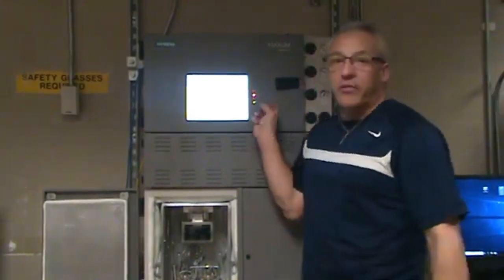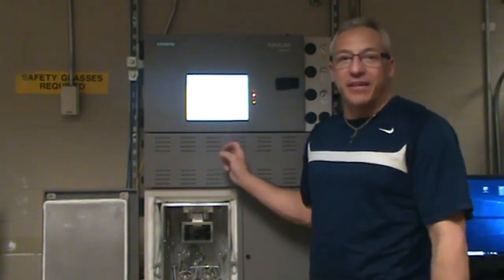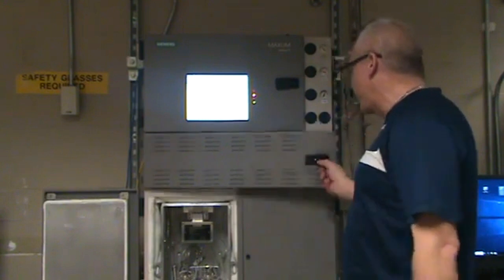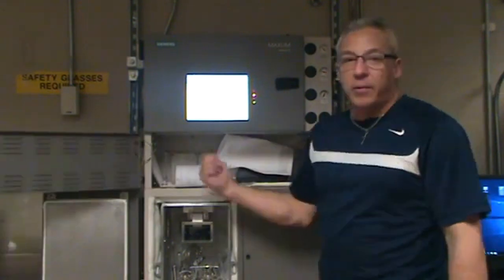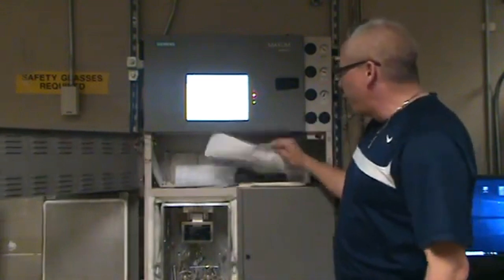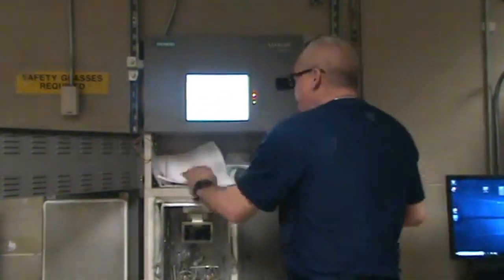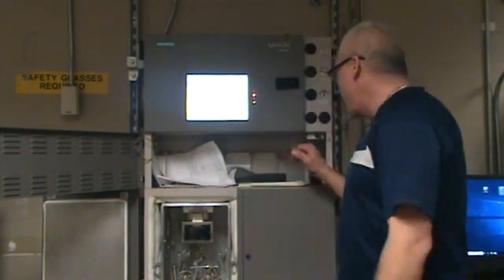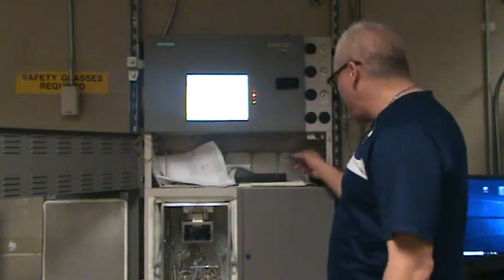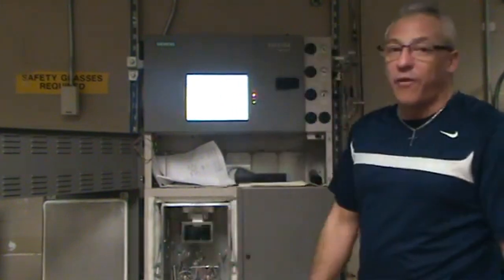This is our electronics enclosure. This is, if you're Hispanic, this is a magazine, but if you're not, this is your mezzanine. Inside of your mezzanine, a lot of people just throw trash in here and stuff like that. Throw your flow meter. Here's your flow diagram of what's going on in the analyzer. If you have a flame ionization detector or a flame photometric detector, they would be mounted inside of here. Instead, this is where our tubes are coming through, which are going down to our valves down here.